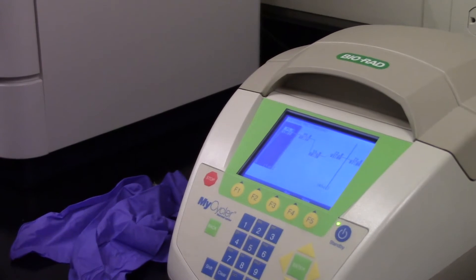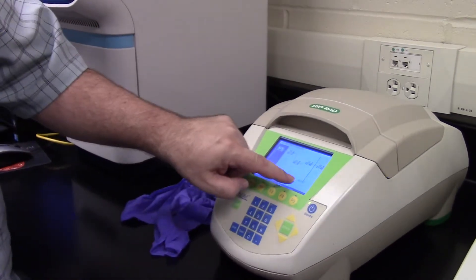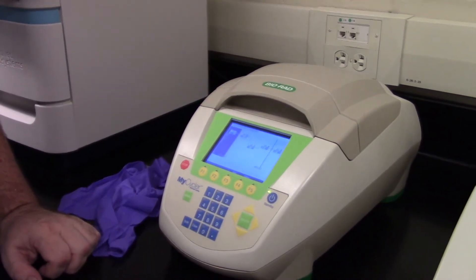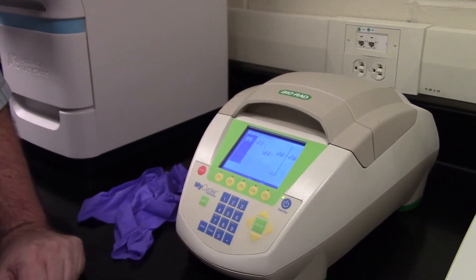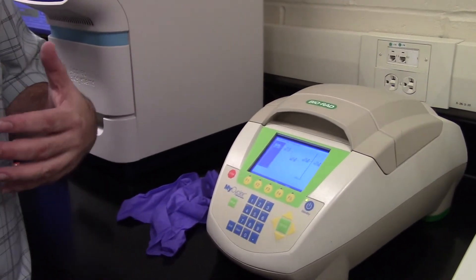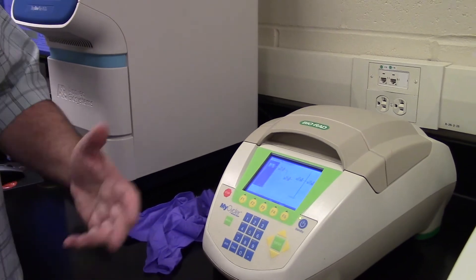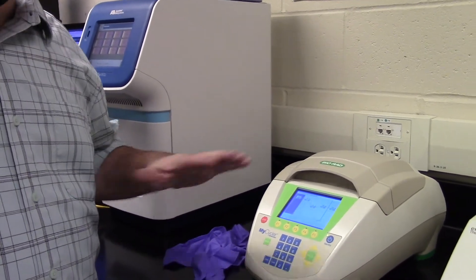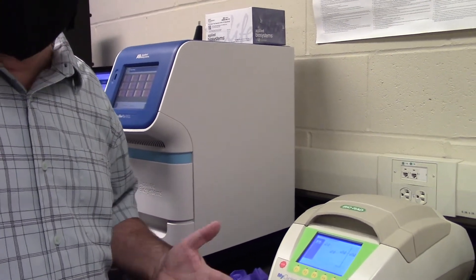So this would be a relatively long PCR product at 3 minutes — maybe 1,000 to 2,000 base pairs long. Notice this tells us how many times it will repeat these three temperatures: 40 times ensures us to get a product. If we want to compare one gene to another or one tissue to another with the same gene, we would want to use lower numbers of cycles. Here we're just trying to make as many copies as we can, so this is not quantitative in any way — we're just checking: is the PCR working, do we get a product, or do we need to design new primers?